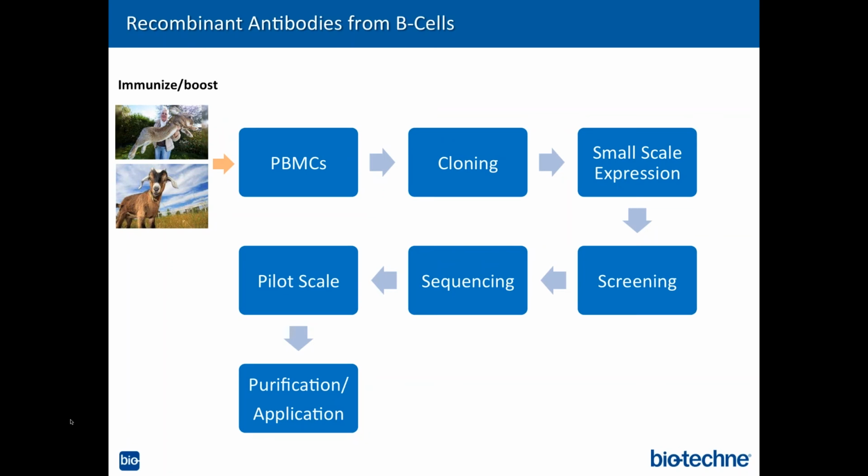the traditional standard antibody applications people would look at, Western, ICC, as well as all the way out to our ELISA applications. We're then screening the clones that have been picked by a group of researchers that have reviewed all the data for specificity, sensitivity, and we're picking the best clones based on the panels.